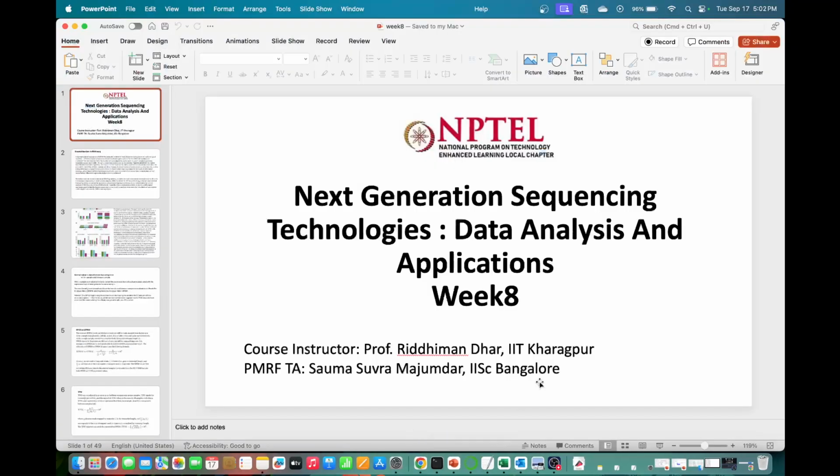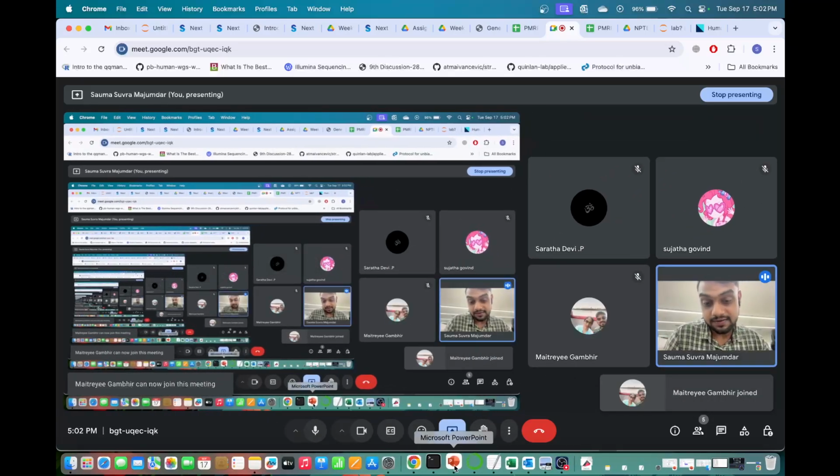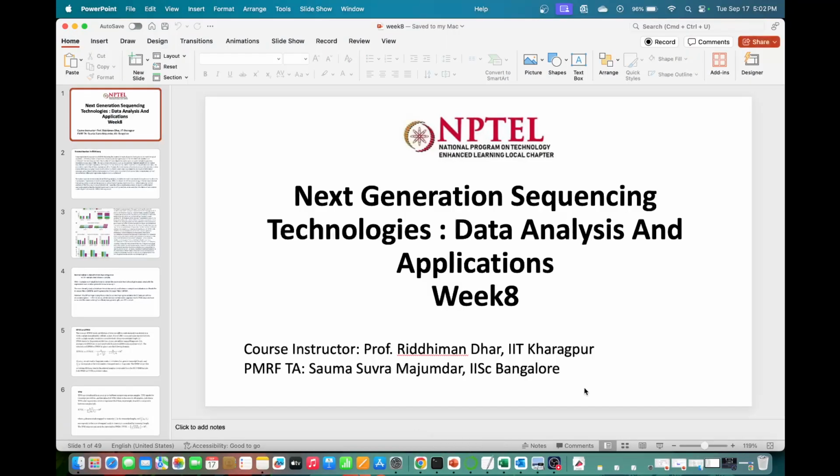Okay. So last class. Welcome to week 8 of NGS data analysis and applications. Last class we talked about structural variants, how to uncover them, and what are the different types of evidence that we look for while detecting structural variants. And we also touched upon RNA sequencing technologies and alignment, how there are splice-aware and splice-unaware alignment tools.